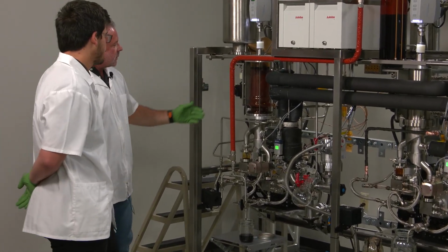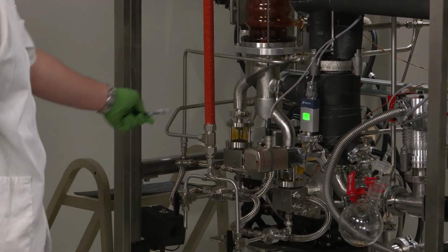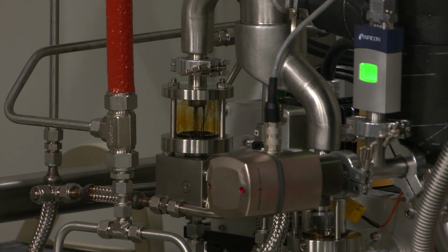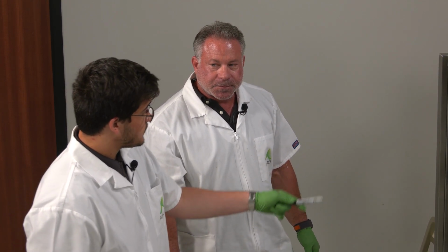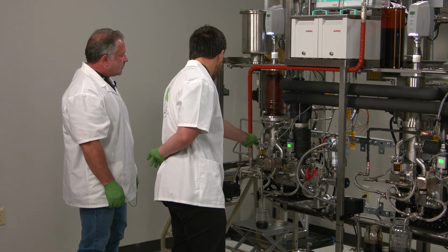Okay. This is our target analyte on this system, our residue line, and that's all of our CBD and THC. So these molecules over here were freed from the oil phase. Correct. And now all of these are untouched. Correct. Well, not untouched, but they couldn't break free of their liquid state. Exactly. So this is about, you said 30 degrees, right? The condenser in here? 30 degrees throughout, all the way to where it's dripping down here?